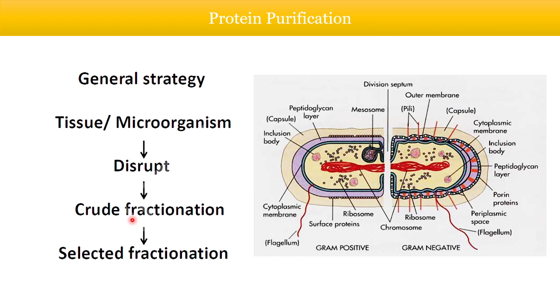Your protein can be either in the supernatant, or your protein can be there in the pellet. Whatever it is, you can get your protein.